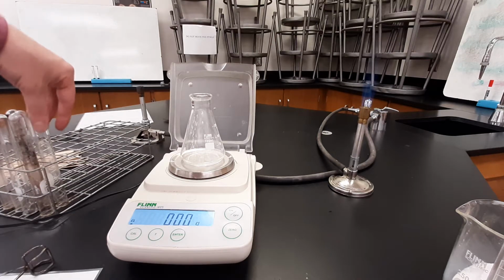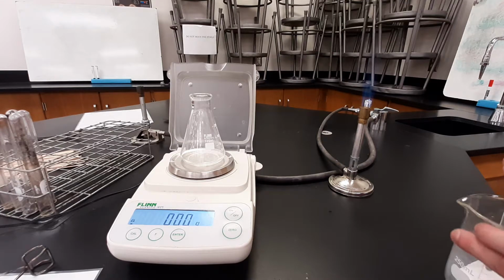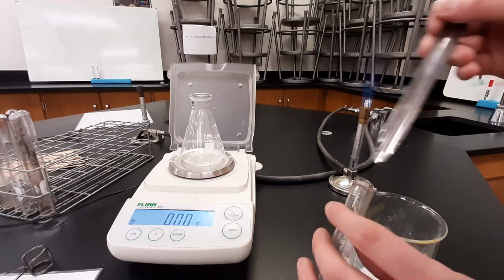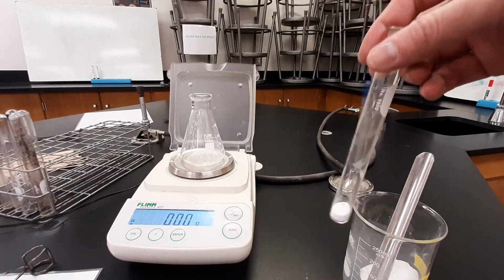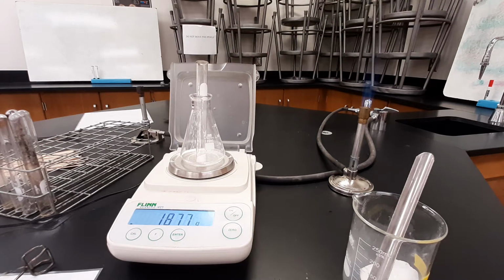Reaction number 3. The first thing I'm going to do is take a scoopful of solid sodium hydrogen carbonate and add it into a dry test tube. This is a scoopful of solid sodium hydrogen carbonate. I'm going to get the mass of this. Before I do anything to it, the mass of the solid sodium hydrogen carbonate inside the test tube is 18.77 grams.